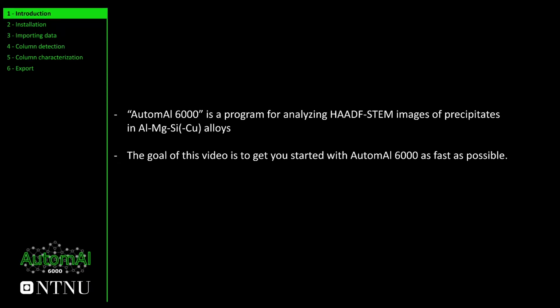Now, AutomAl 6000 is a program for analyzing high-angle annular dark field scanning transmission electron microscopy images of precipitates in aluminum, magnesium, silicon, copper alloys. And the goal of this video today is to get you started with the software as fast as possible so that you get to try it out and see if this is something you can use.